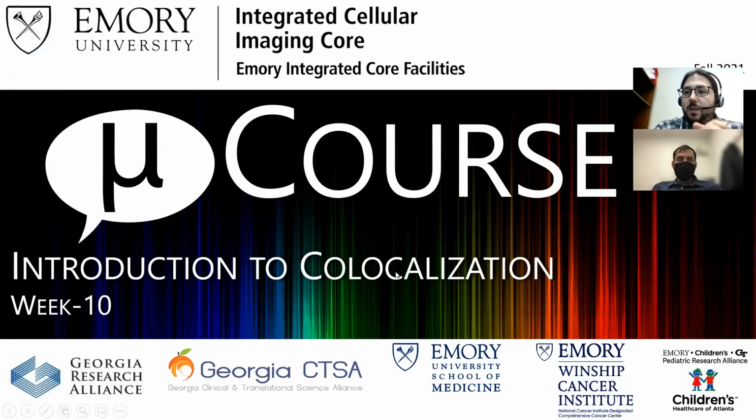All right, so welcome everyone to the final talk of our micro course here at Emory, going over how to use Fiji in bioimage analysis. Today, I'll be covering colocalization with all of you.